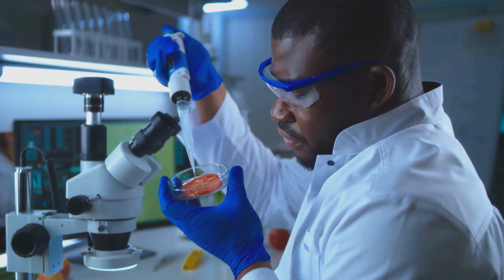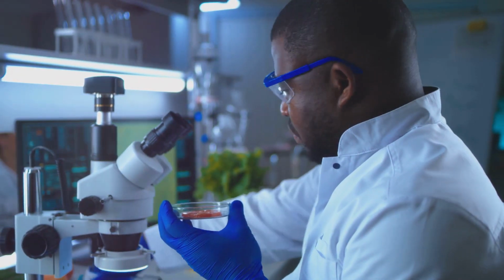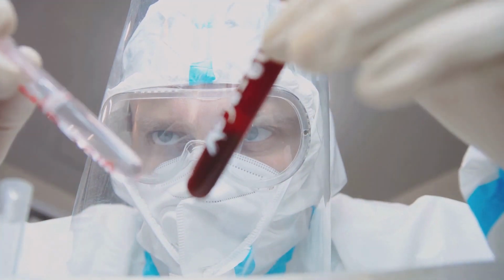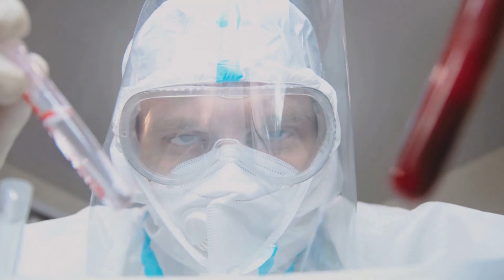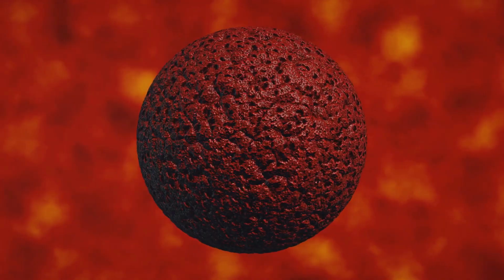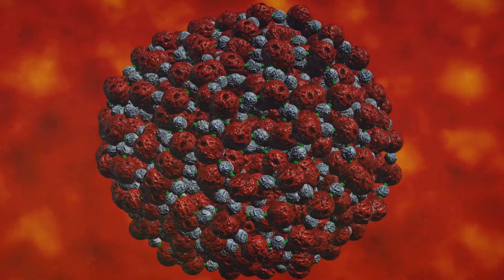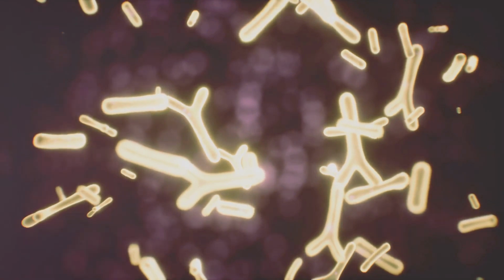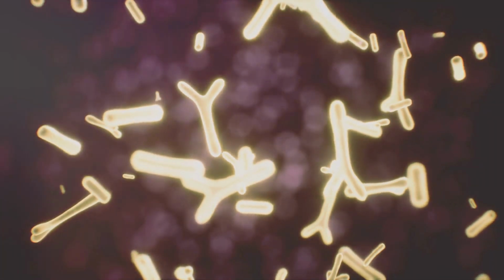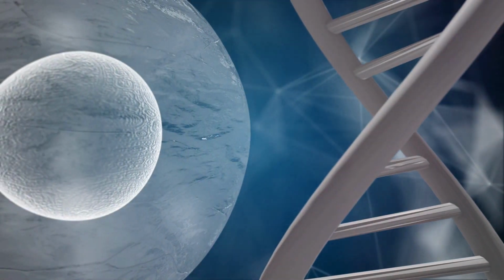Viral transfection involves using viruses as vehicles or vectors to deliver genetic material into cells. Now this might sound a bit alarming, but don't worry, these viruses are engineered to be safe and won't cause disease. Firstly, let's talk about adenoviruses. These little guys are pretty versatile, being efficient for a wide range of cell types. They work by entering a cell and delivering their genetic cargo without integrating into the host genome. This characteristic makes them perfect for transient expression, that is, short-term expression of the introduced genes.